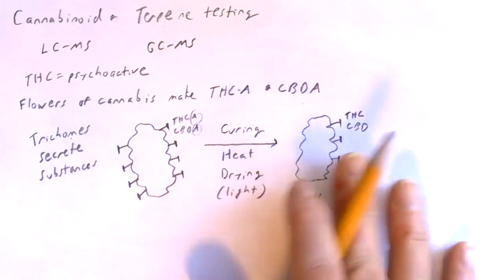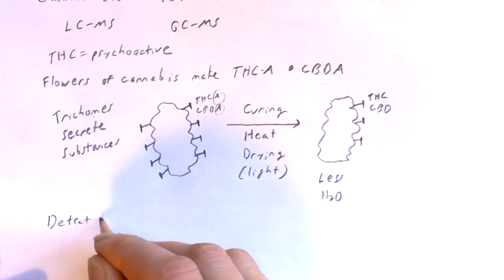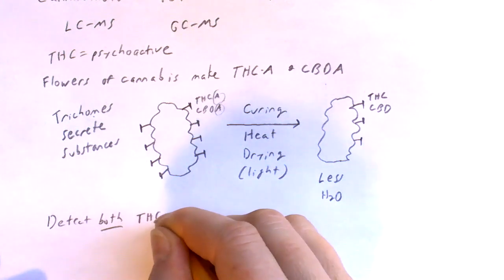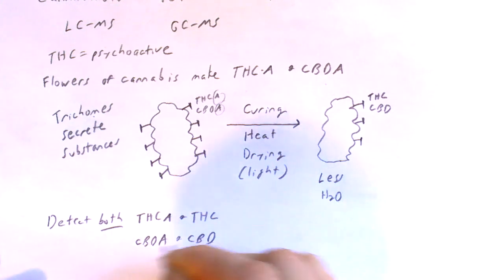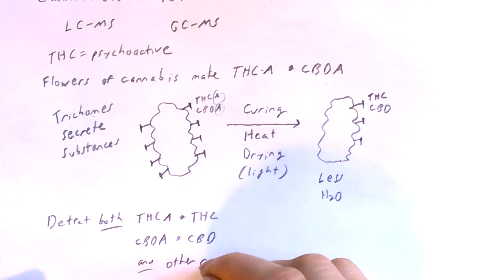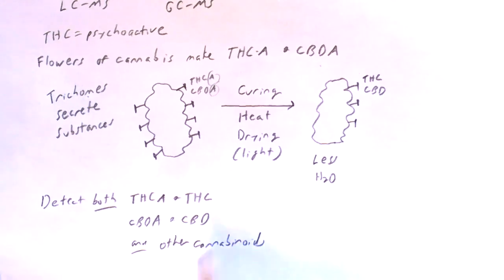And when you do the test, you end up detecting both THCA and THC and CBDA and CBD, and there are other cannabinoids as well. We won't talk about them all right now. Okay, so that's just good to know.